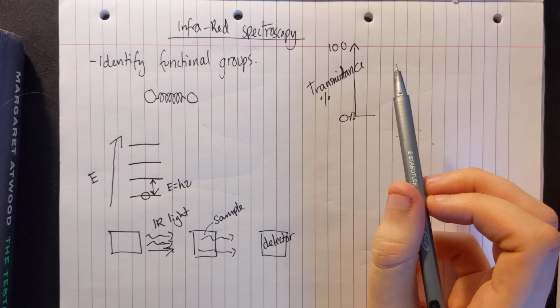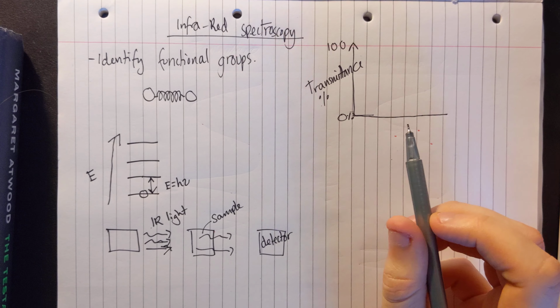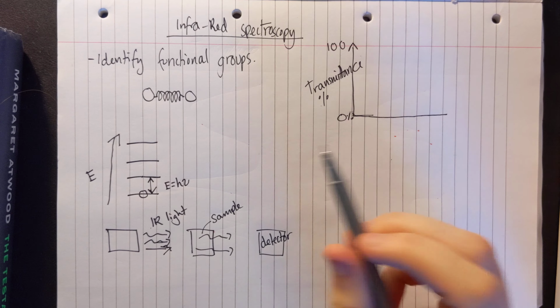So this, down the bottom, is going to represent our wavelengths. So the frequency or wavelength, very highly interconnected, is what's plotted along the x-axis. Now, those give rather inconvenient numbers. If we used frequency or wavelength, we wouldn't get numbers that are easy to deal with. And so instead, chemists use this thing called a wave number.